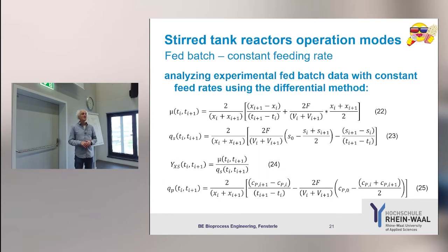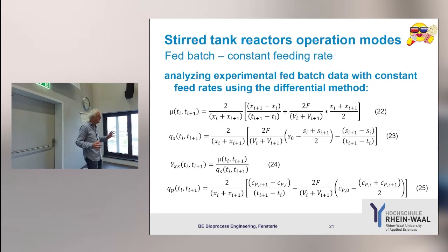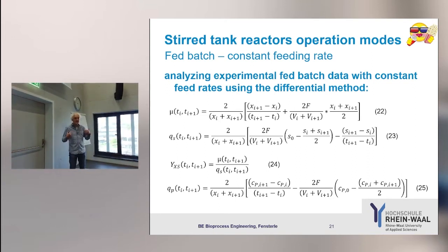Transferring these formulas takes a minute. And make sure that it's correct. Check it a couple of times, because the error source is putting these formulas in incorrectly. And you never make that mistake. Also, I don't. Initially, there's always an error. So check whether it's reasonable. And then you just copy it down and that's it. So this is how you can use that for calculating experimental values.